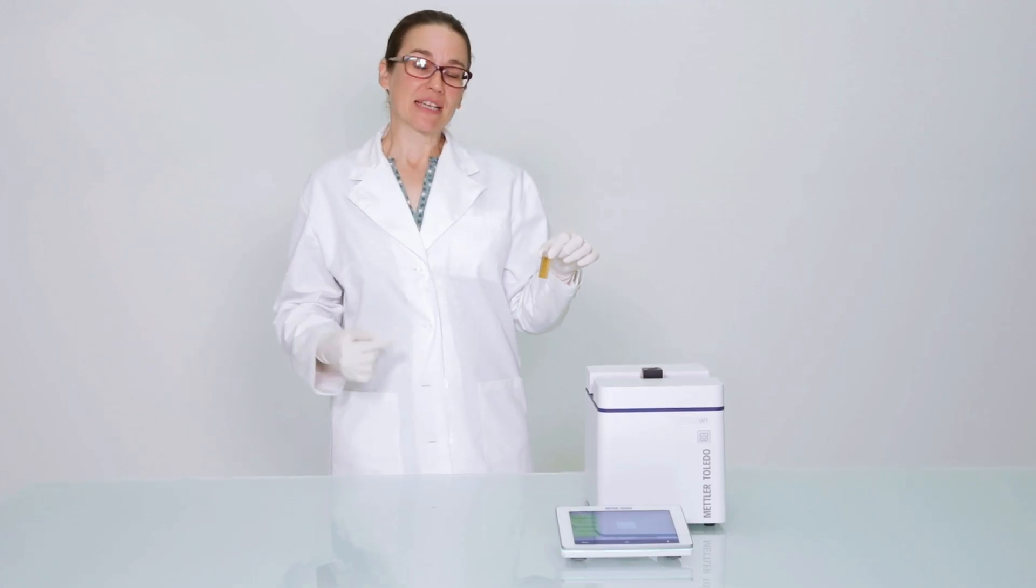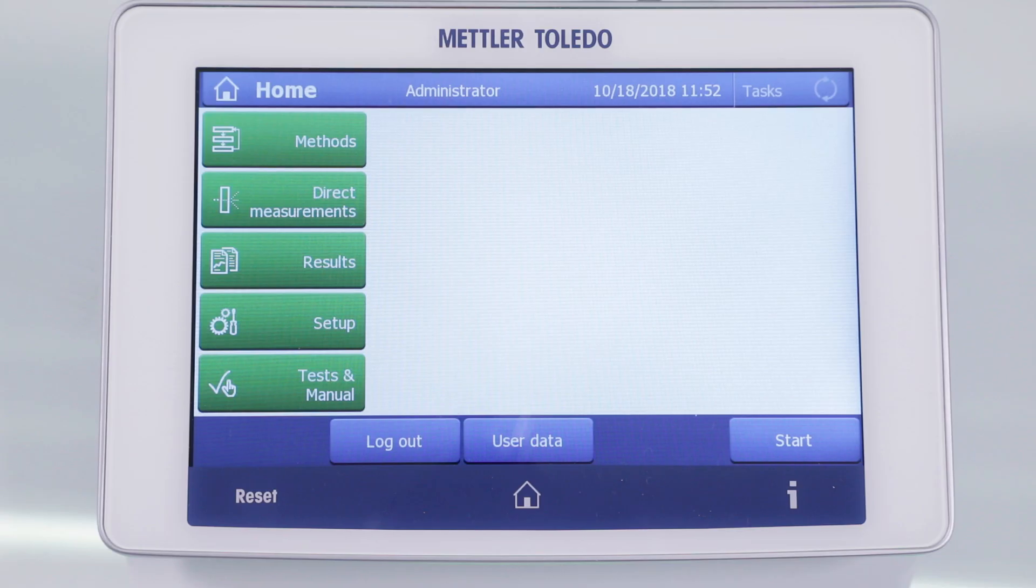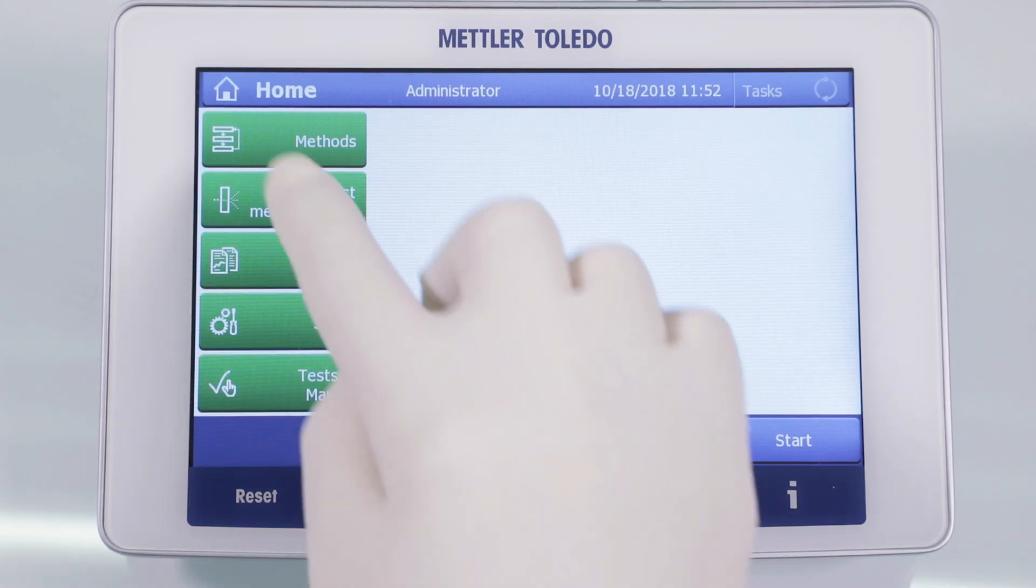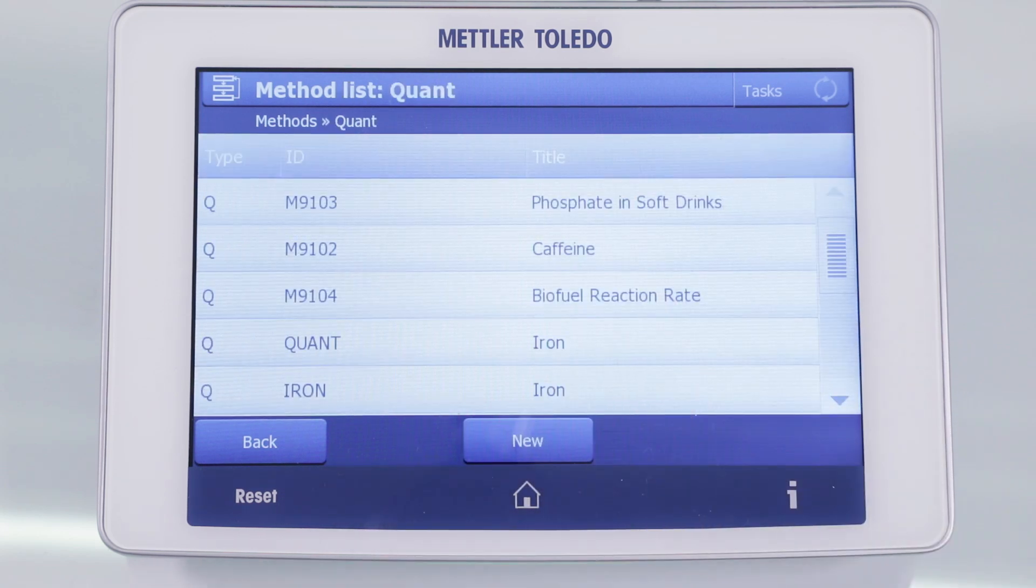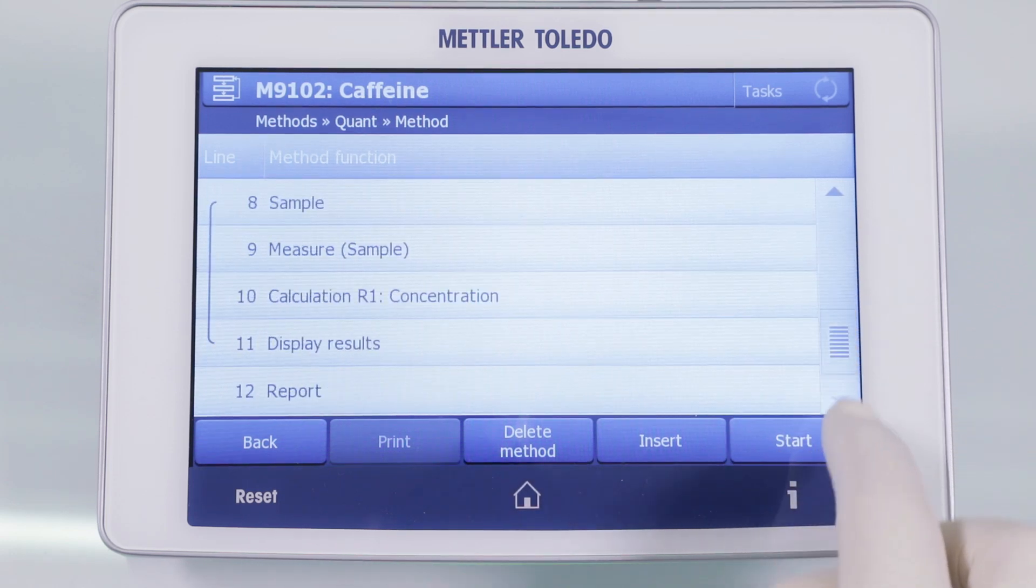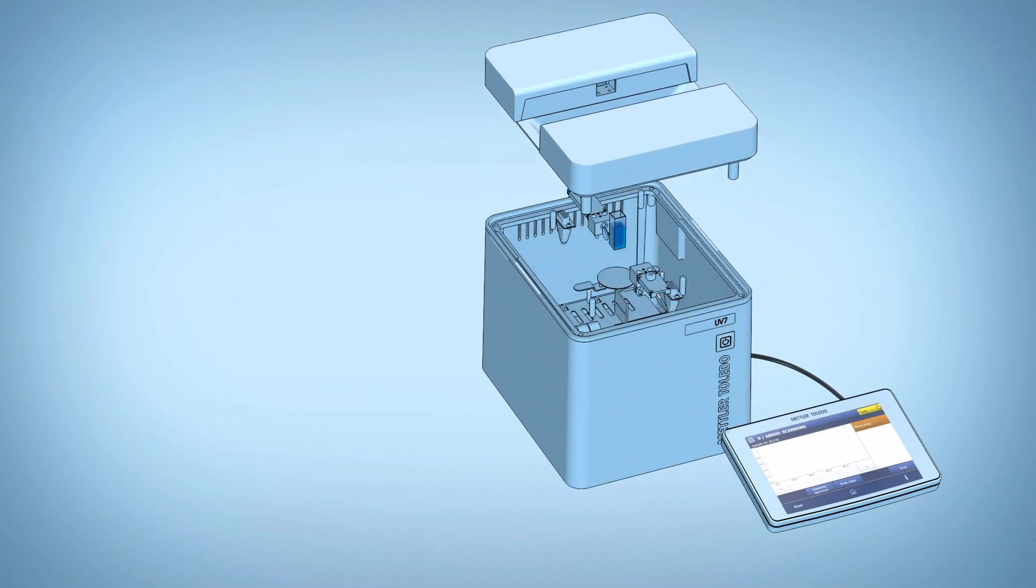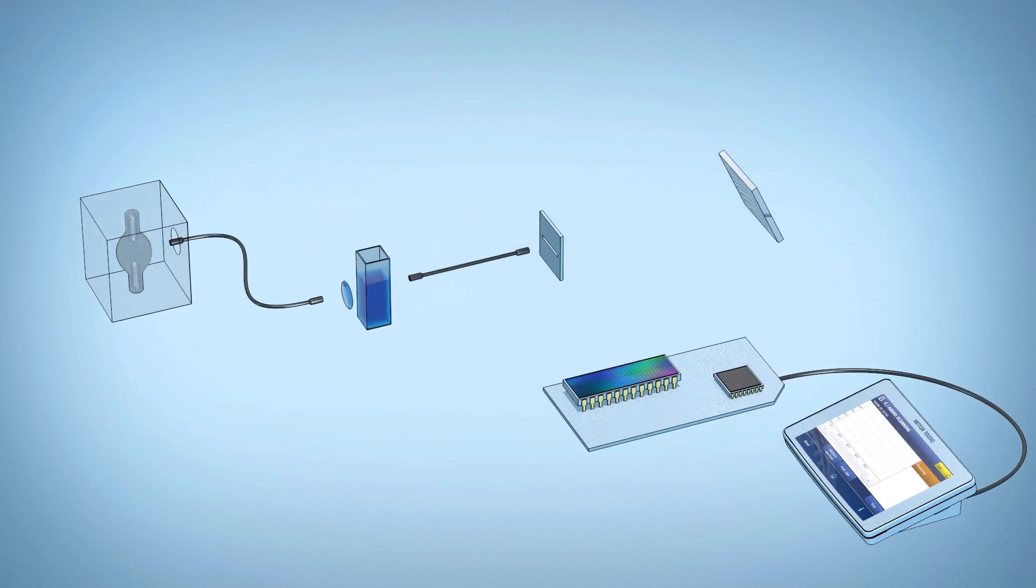First, we place the cuvette containing the sample into the spectrophotometer. Luckily for us, the Mettler Toledo UV-Vis spectrophotometer has a pre-programmed method for measuring caffeine concentration, which easily guides us through the required steps.